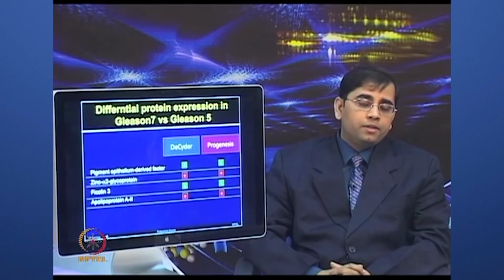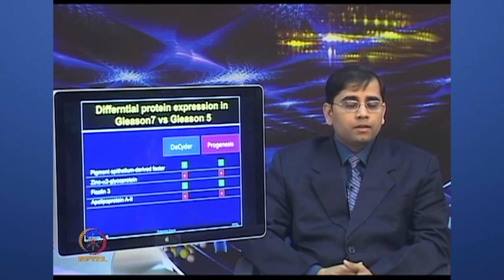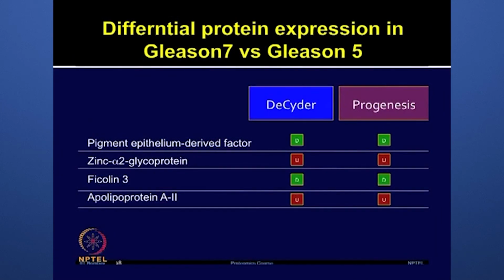After mass spectrometry was done, the identity of these proteins was established. The authors also analyzed these DIGE gels using two different software packages, DeCyder and Progenesis, so that they were very confident that all the proteins to be analyzed by mass spec were very reproducible.